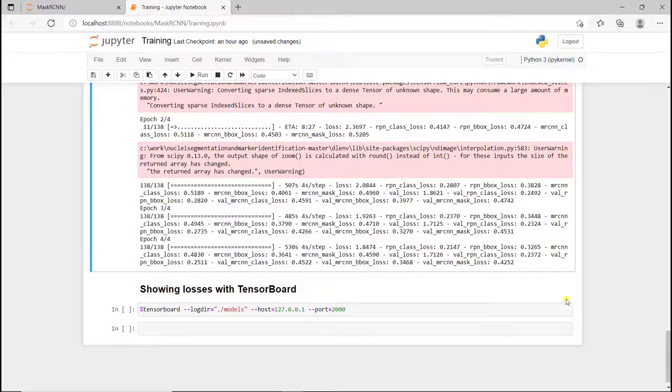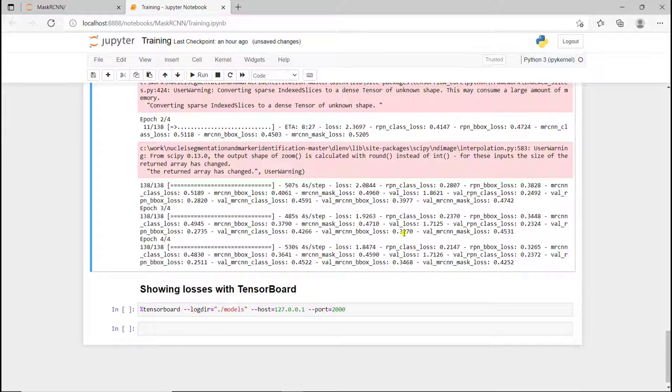Alright, training is done. As you can see, there's a bunch of different losses. The first one here is the loss for the class at the end of the region proposal network, and the bounding box loss for region proposal network.